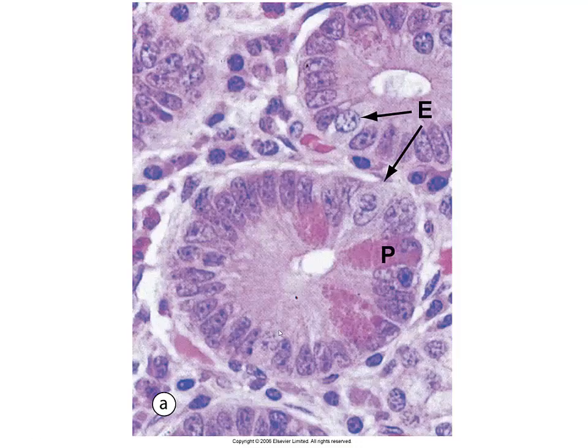If we look in a different micrograph, again, this is a cross section through a crypt of Lieberkühn, but you can see many of these columnar cells, and then all of a sudden you see these red granules just absolutely filled with these red granules. This is possibly one that doesn't quite have as many granules, but Paneth cells are going to be pretty difficult to miss.